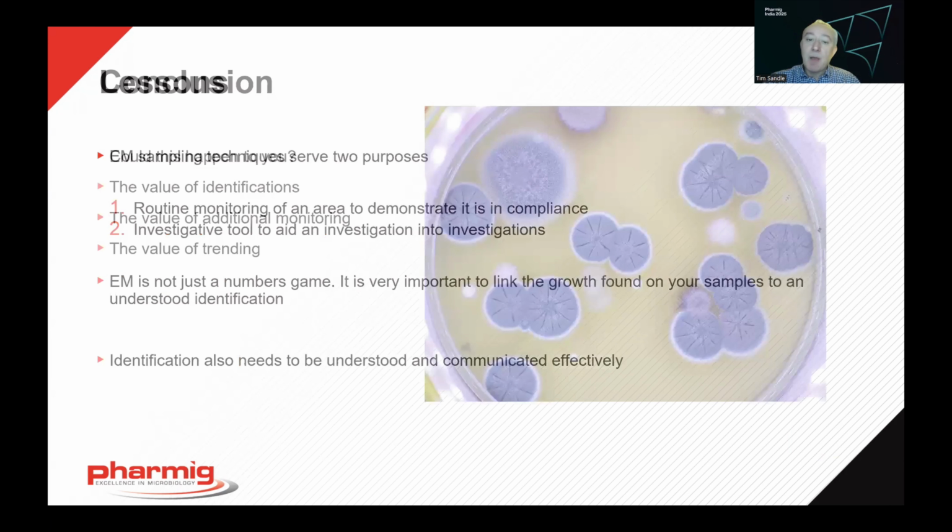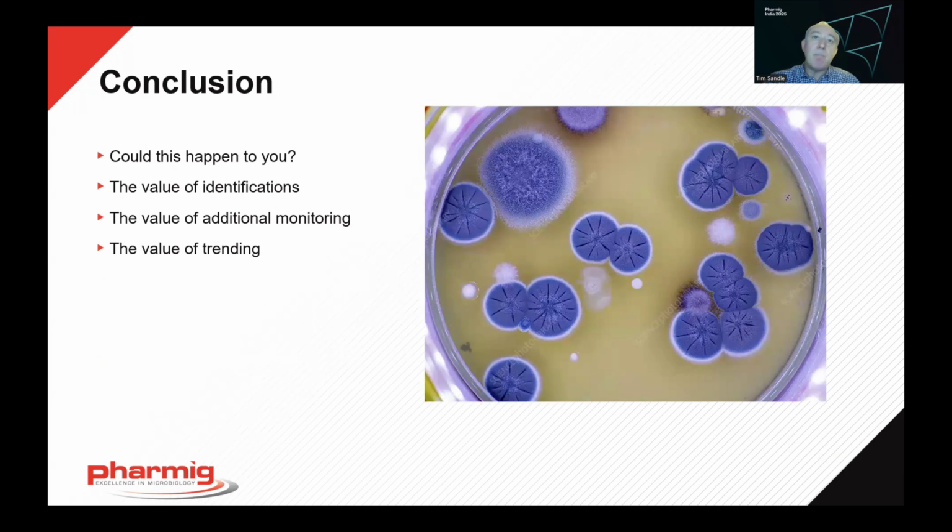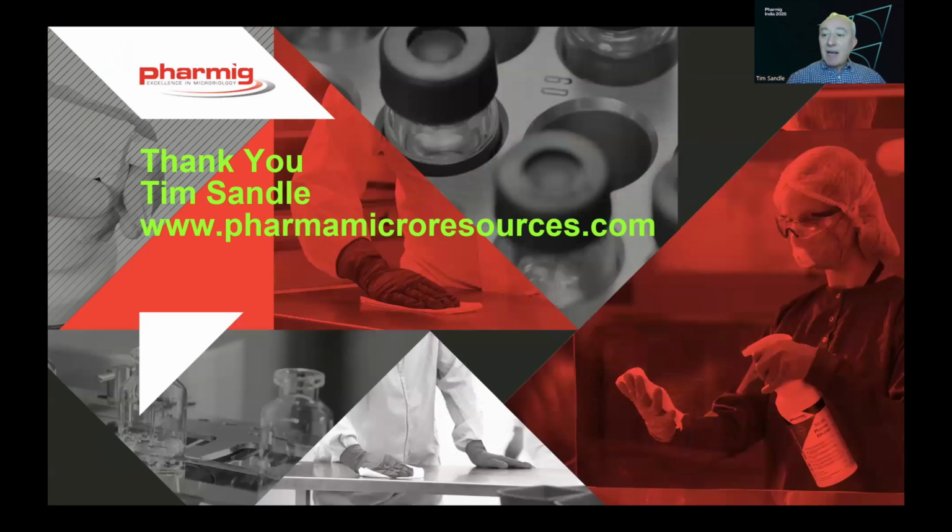Okay, so this is starting to bring the presentation to an end. I've covered some environmental monitoring fundamentals, some issues around monitoring methods, their limitations, the importance of risk assessment. We've had a look at a case study as well. And all of these hopefully are things that you can weigh up and they'll be of practical value for developing your environmental monitoring position papers, your rationales, your policies, your method SOPs, and your various follow-up actions.